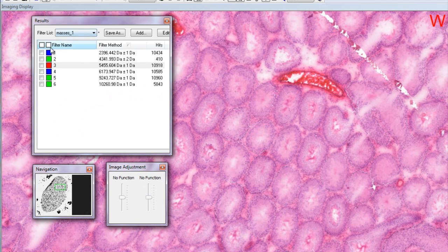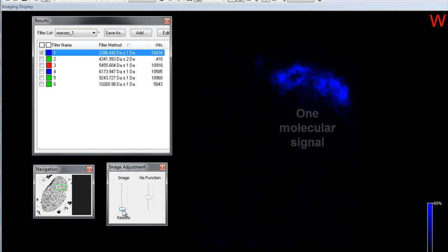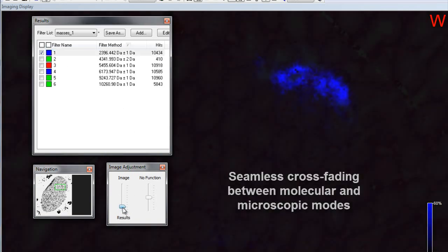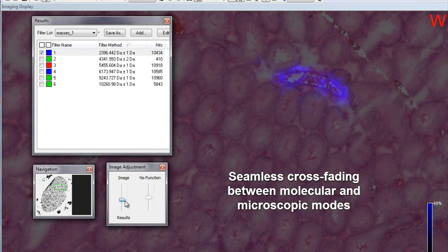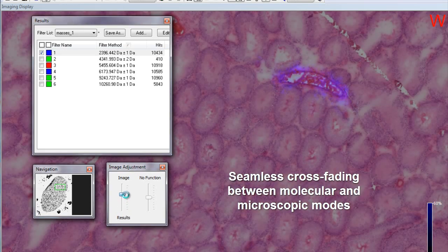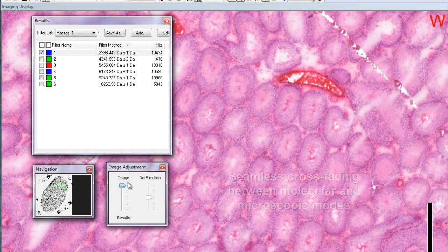If we mark a particular molecular signal, we can see that that signal is highly localized to a single region. Through seamless fading between the molecular and microscopic images, we see that in this case, that molecular image corresponds to the blood vessel in the tissue.